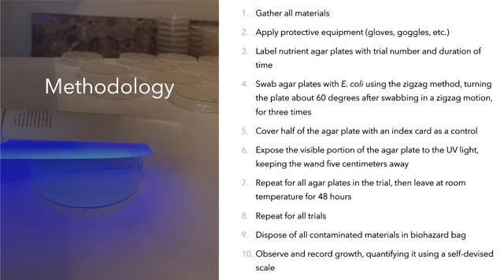All contaminated materials were disposed of in a biohazard waste bag at the end of the experiment, which was delivered to a biomedical waste company.